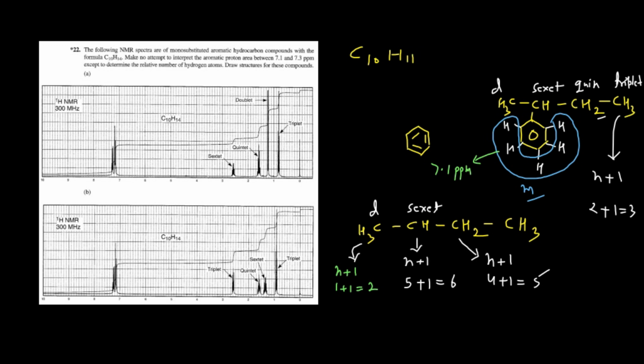And you can see here, this hydrogen, which is only one hydrogen, is connected with the benzene ring, and the circulating electron cloud of the benzene ring will cause magnetic anisotropy, and due to the magnetic anisotropy, this sextet will be very downfield, resonating somewhere around 2.6 ppm. So that sextet will be there at 2.6 ppm. And then you have this quintet. For this one, only 2 hydrogens are here, and on the left hand side 3 hydrogens are there.